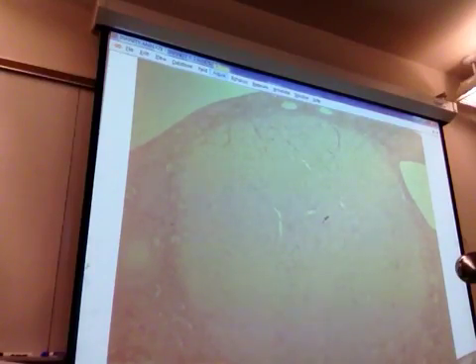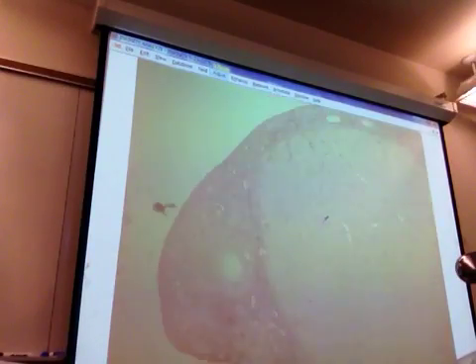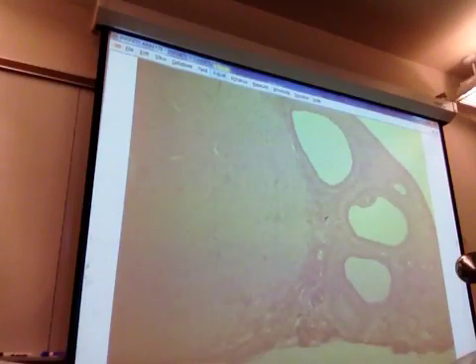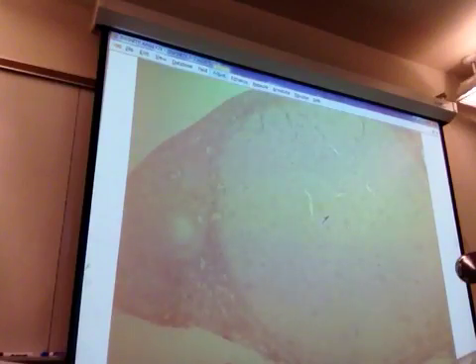So the structures on the right side then? Are follicles. Yes. You're not getting a very good cross section through any of them, so that you can see the oocytes. See, because the oocytes are missing from pretty much all of them. But that's an albicans. Where's that? That's luteum or albicans? Or excuse me, corpus luteum.